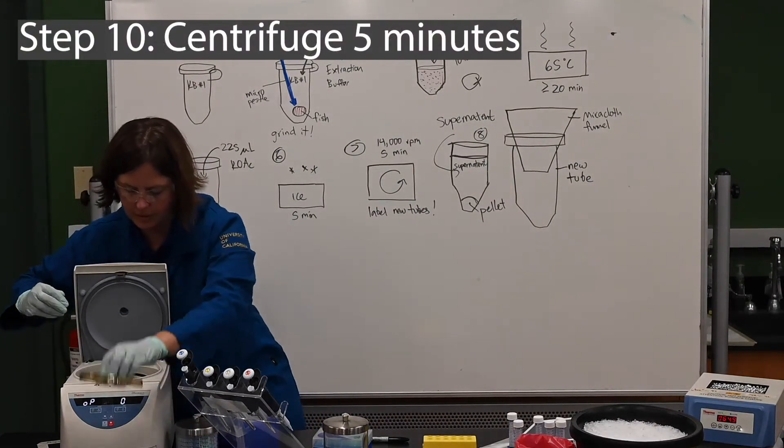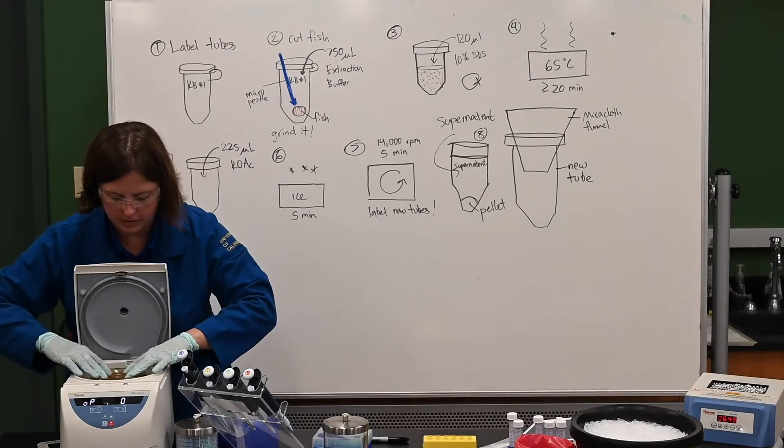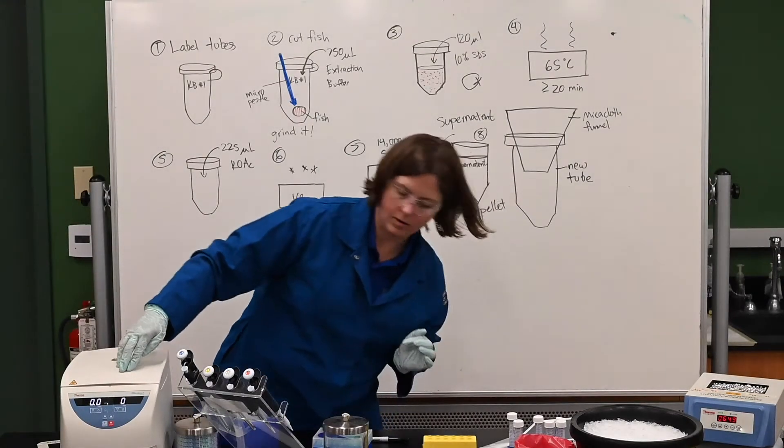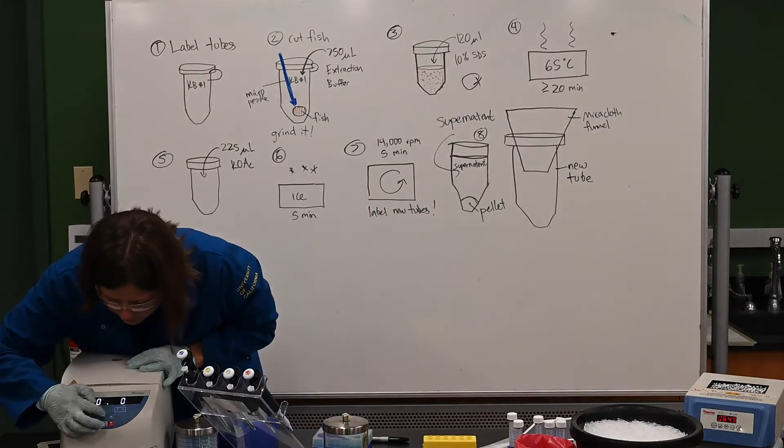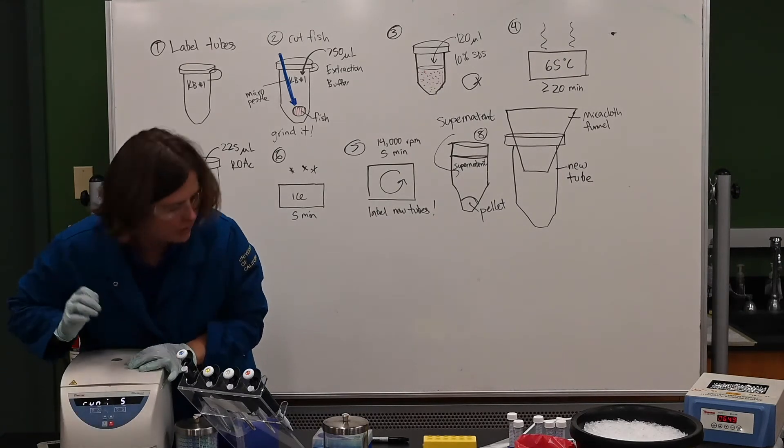Again, balanced, make sure that they're crossed to each other so my centrifuge is even. And you have the top speed. There we go.